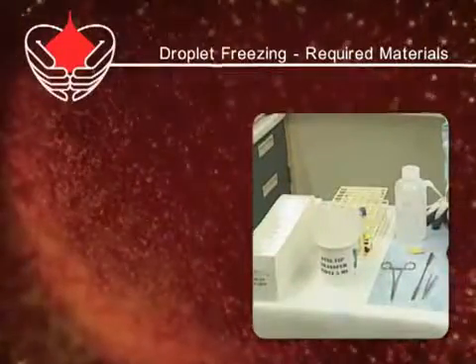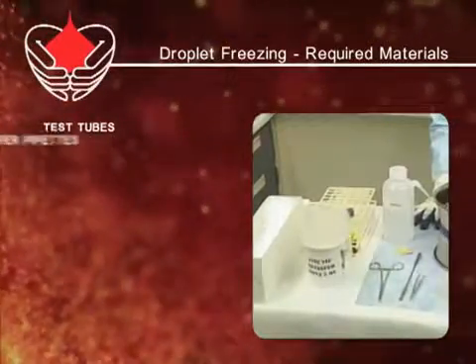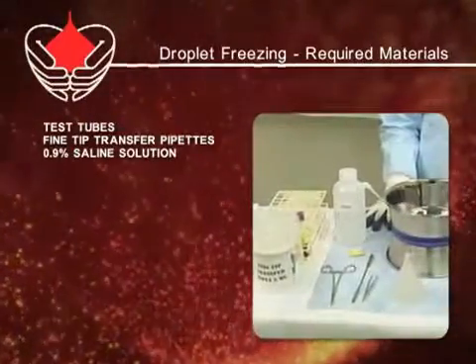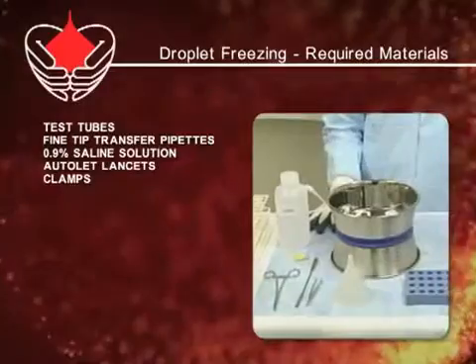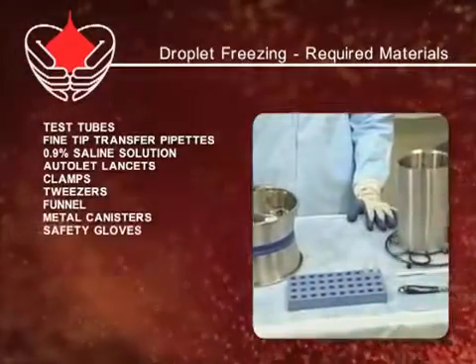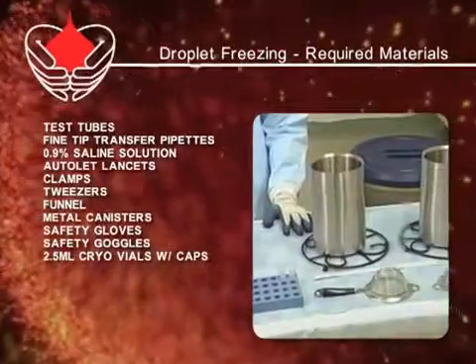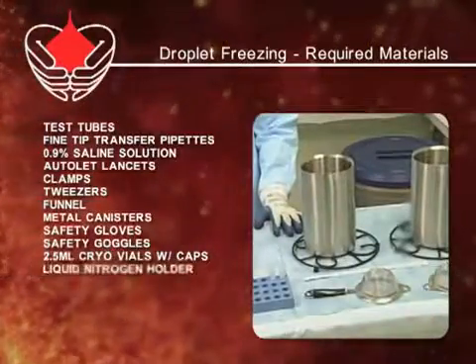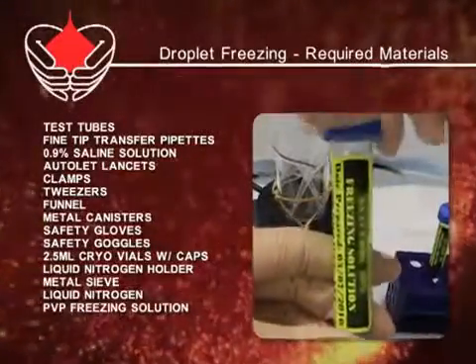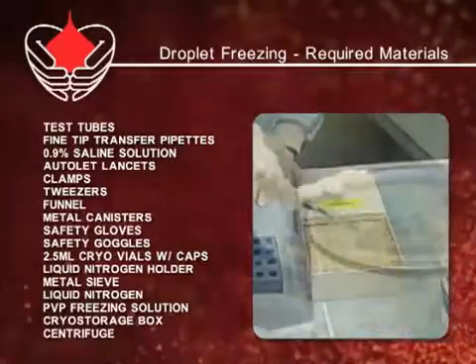The following materials are required to do droplet freezing: test tubes, fine tip transfer pipette, 0.9% saline, auto-let lancets, clamps, tweezers, funnel, metal canister, safety gloves and goggles, 2.5 milliliter cryo vials with caps, liquid nitrogen holder, metal sieve, liquid nitrogen, polyvinyl pyrolidone freezing solution, cryo storage box, and a centrifuge.